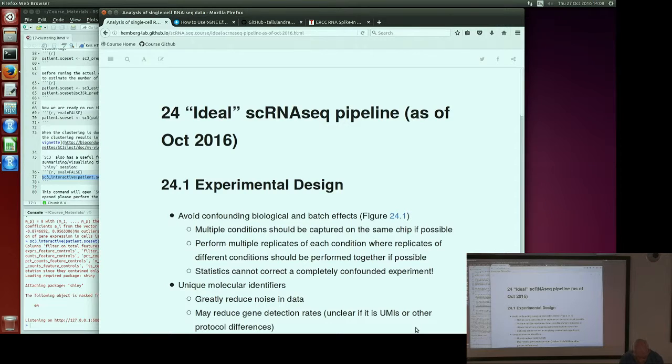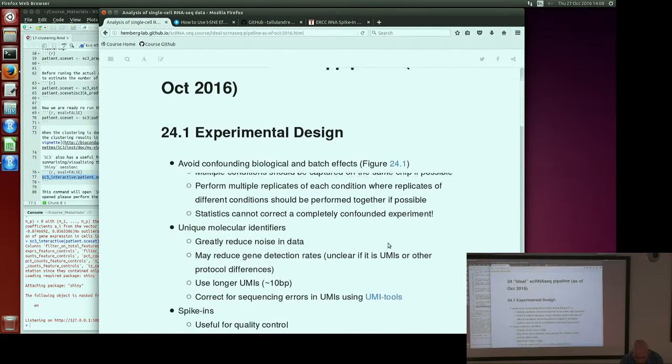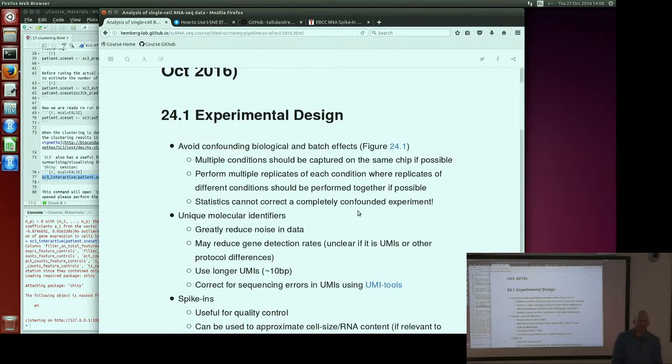As we were discussing, this first bit is about before doing the experiment. This is important for those of you who are bioinformaticians: ideally you want to get involved in the project before people start pipetting, so that you can have a say about what they're considering and what parameters they're using when setting up the experiment. Hopefully that can improve your chances of being able to analyze the data in a meaningful manner.